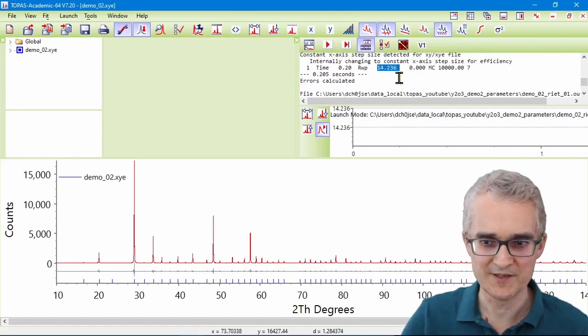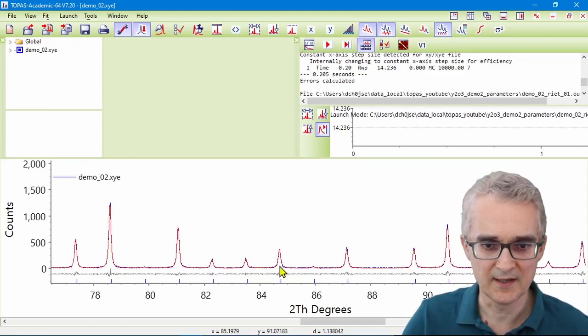We'll just do the Rietveld refinement again, just to make sure we're getting the same R factor of about 14% or so. So here we go, 14.236%. And it's a nice Rietveld refinement with all the peaks calculated in the correct positions.